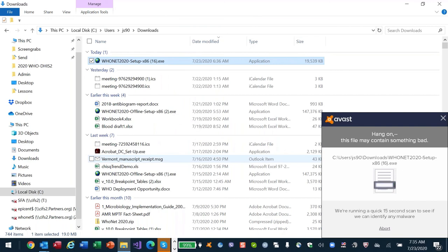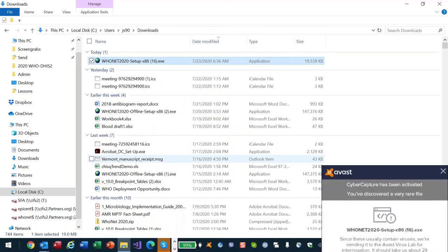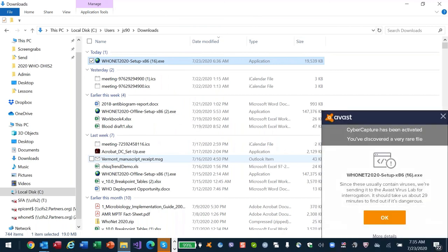Okay, good. It might be related to distributing WHONET. We have a secure digital certificate. It's valid for 3 years. It expired last week and we purchased a new one. So this is the very first time that we are using the new one. So there must be some issue there of configuration. And good. So all right, I will not do the new software there.